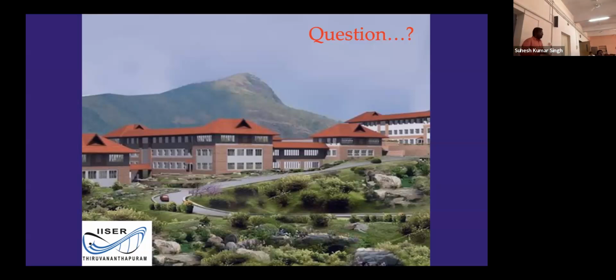What is the actual resolution that you have, somewhere in nano or in micro? For photoacoustic microscopy, the resolution for OR-PAM is 500 nanometers, 500 to 600 nanometers. They have done single cell imaging, but the penetration depth is only for surface imaging.